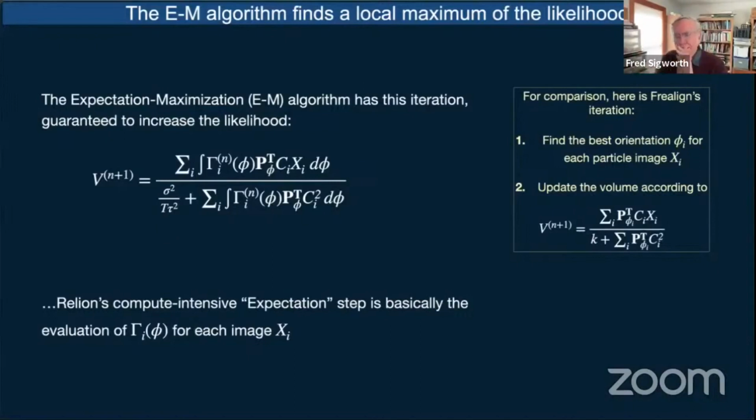That is, if we have a box with a relatively small particle and a whole bunch of space around it, when we compute the noise, we're going to see a whole lot of noise. But when we compute the signal, we're only going to see the signal from the particle in the middle. And so in 2D, the ratio between the area that the particle takes versus the area that the noise takes is on the order of 2, and in a volume that ratio might be more on the order of 4. And so these values of this fudge factor of 2 or 4 make some sense in the relative size of the particle to the box.